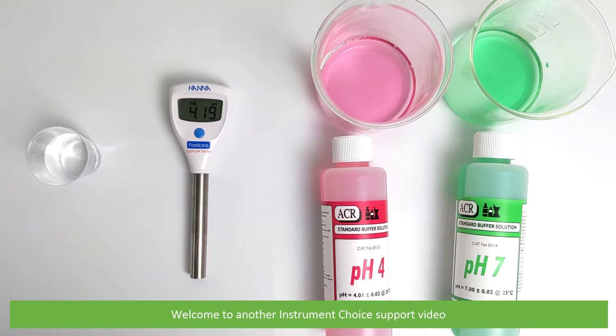Hi and welcome to another Instrument Choice support video. In this video, we'll demonstrate how to calibrate the ICHI 981035 FoodCast Issue PH tester.